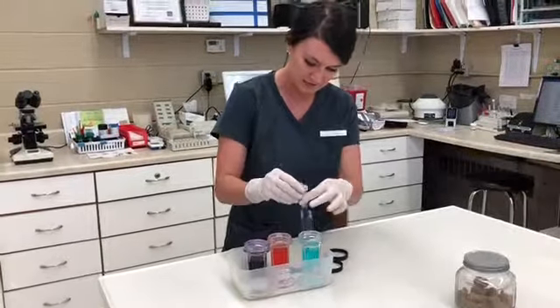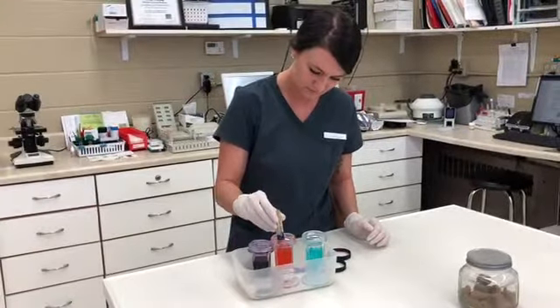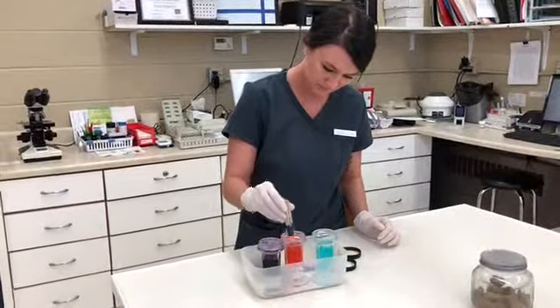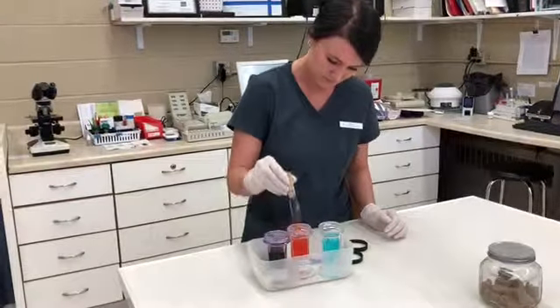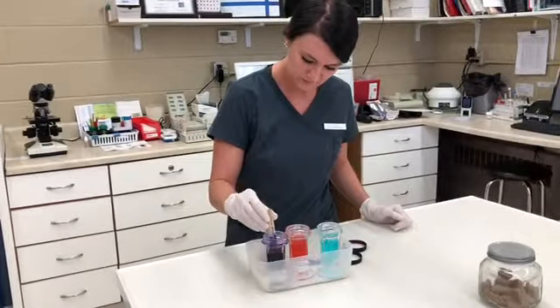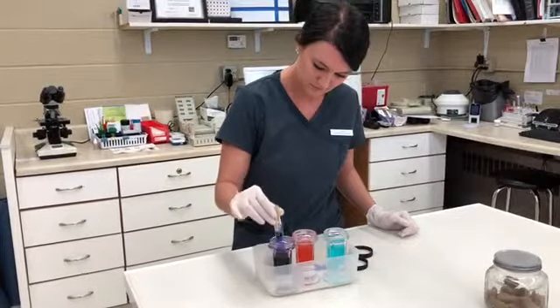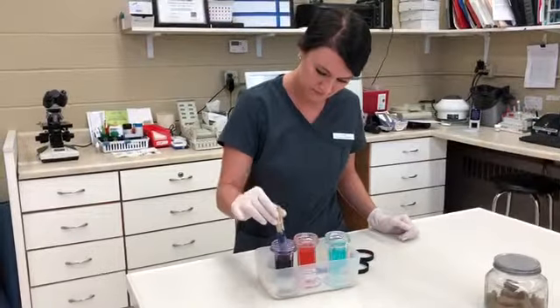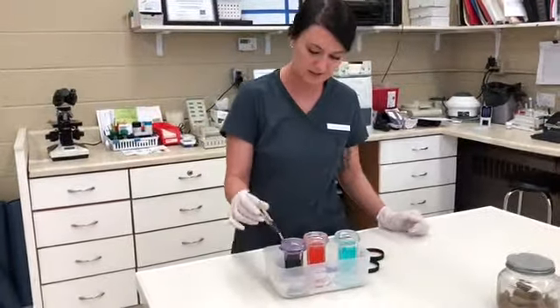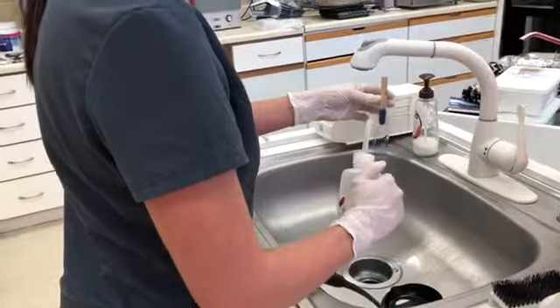And ten — let's go ahead and move on. Okay, that's ten for the second stain, and then the last stain here. And ten. I'm actually going to head on over to the sink to grab my distilled water and get that excess stain off.